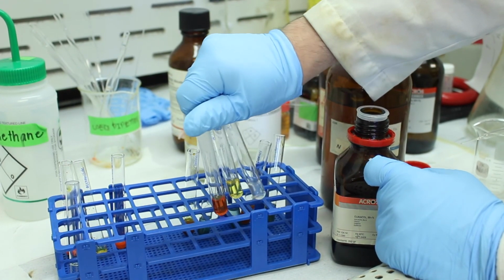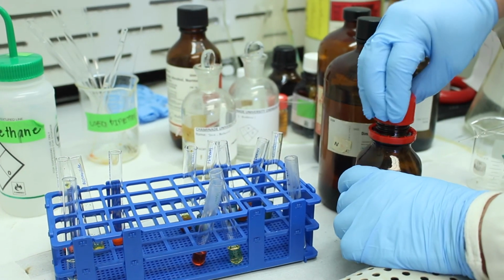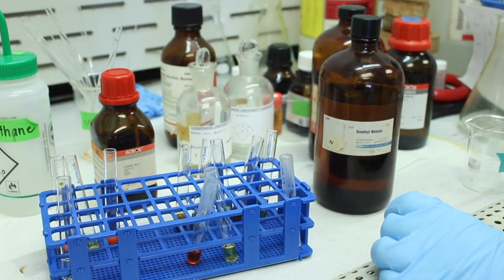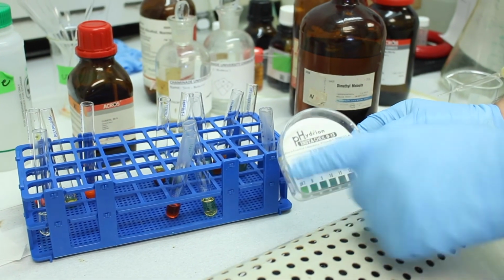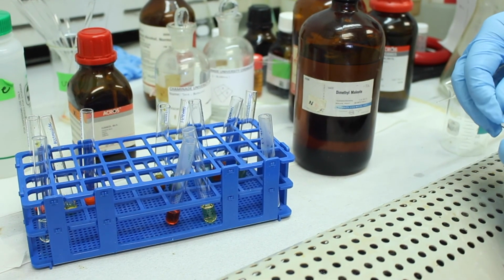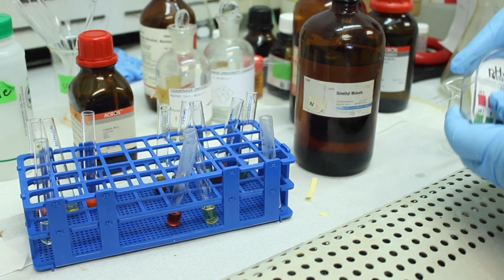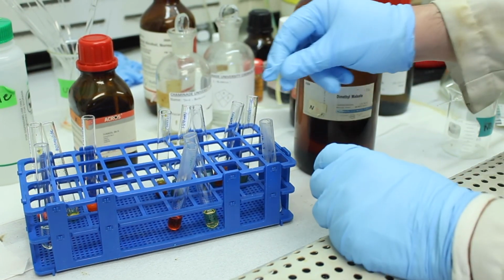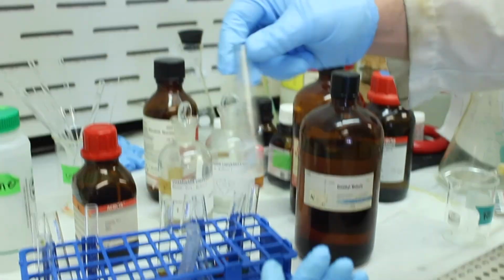Now, if we wanted to detect if it's an EAS reaction, one way to tell is if there is HBr gas in the headspace of the mixture. So what we can do is take some pH paper. This is just universal pH paper. What we're looking for is orange or red. That indicates the presence of acid. So we'll take a little strip. If I can get it, here we go. Need a longer strip than that. Okay, we'll bend it a little bit, and then we'll place it in the headspace of the test tube. We'll agitate it.